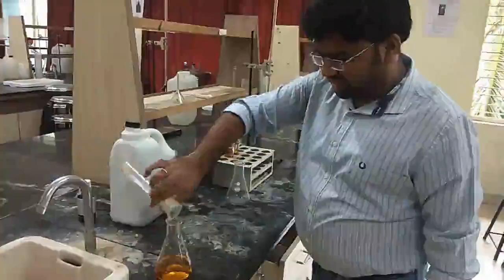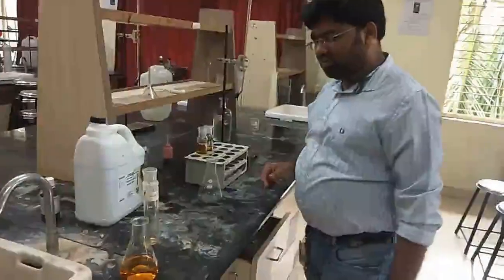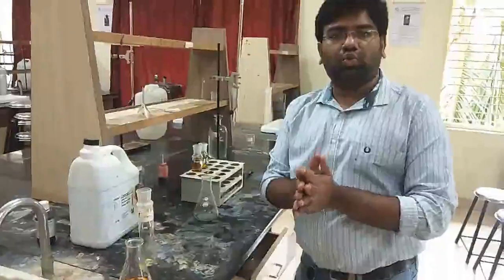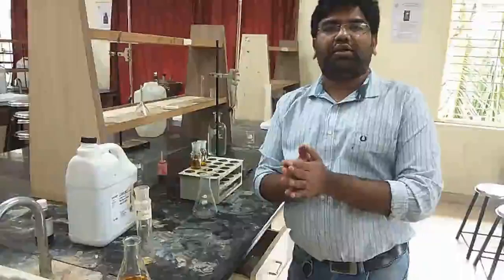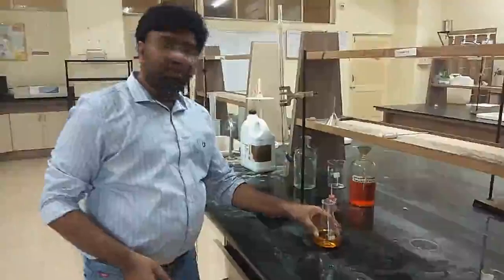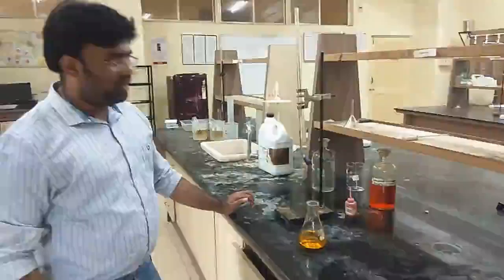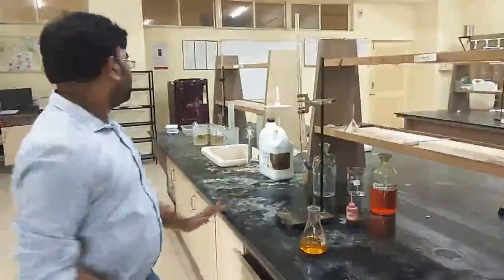You can even take the glass flask, right? So similarly, we are going to empty all this into the conical flask. We are going to cool it. We are going to add a ferroin indicator, and then we are going to do the titration process, right? So we have emptied the sample in the flask. The next step is just to add the ferroin indicator and do the titration process.